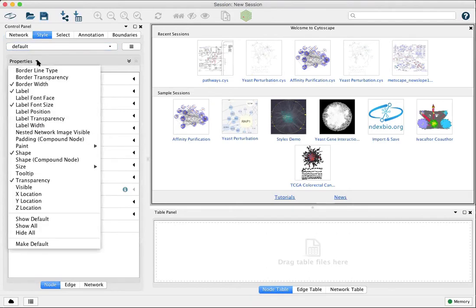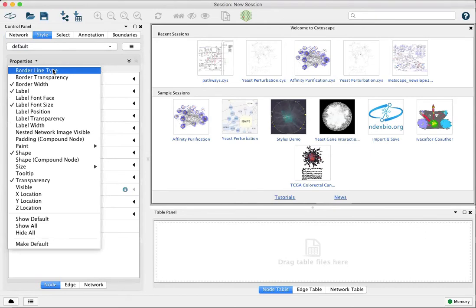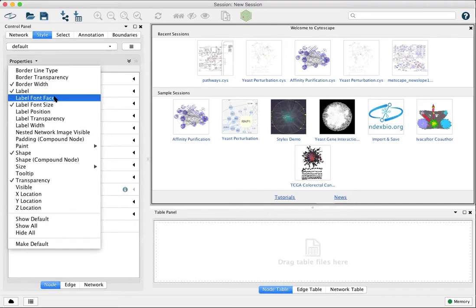Things like the type of borderline, whether it's dashed or solid, for example. The font face for the node labels.